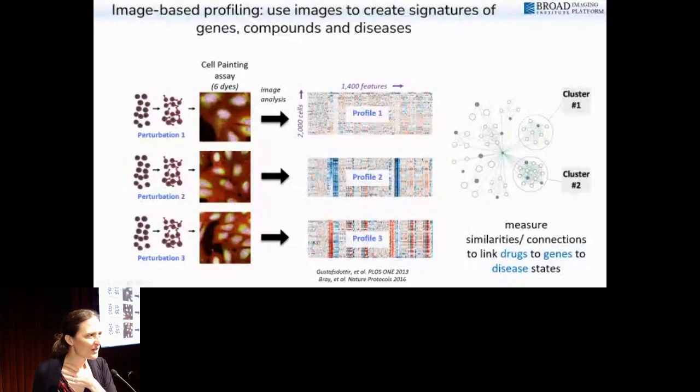The question is, what cell types? Of course, you can test any cell type you like, and I'll give lots of different examples. But just like transcriptional profiling, there will be certain questions you can only answer in just the right cell type, and other questions that might be more general, and other drugs, for example, that might do the exact same thing in all kinds of different cell types. So that's part of the experimental design.